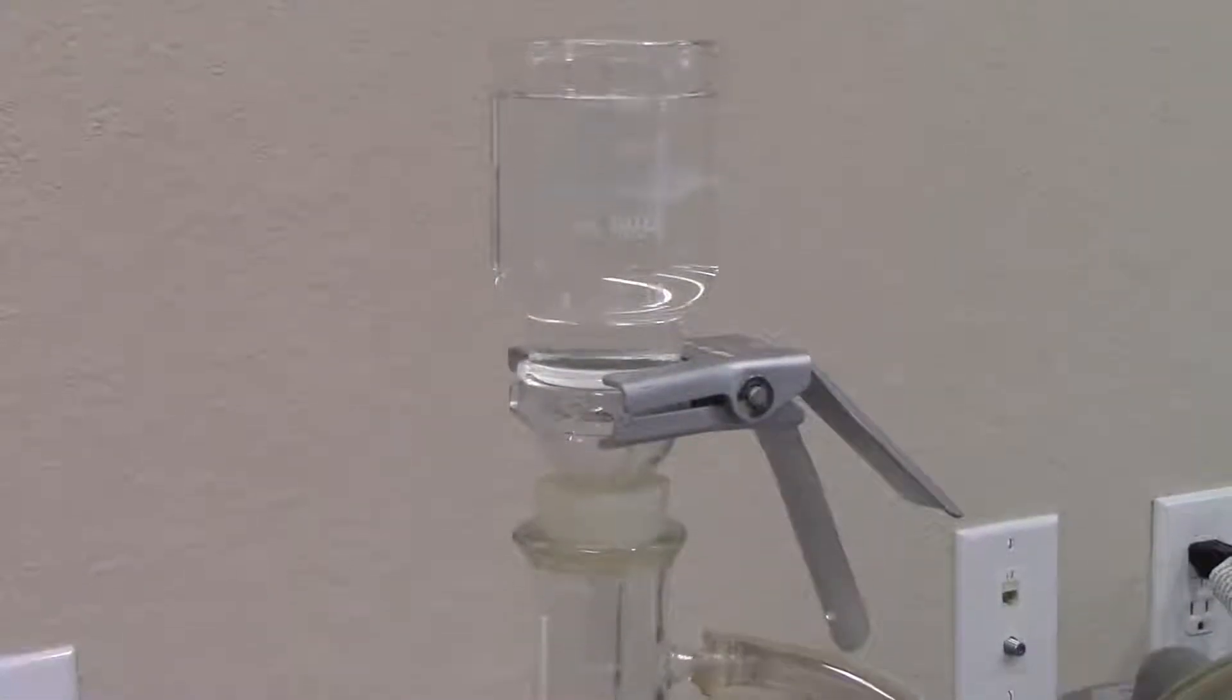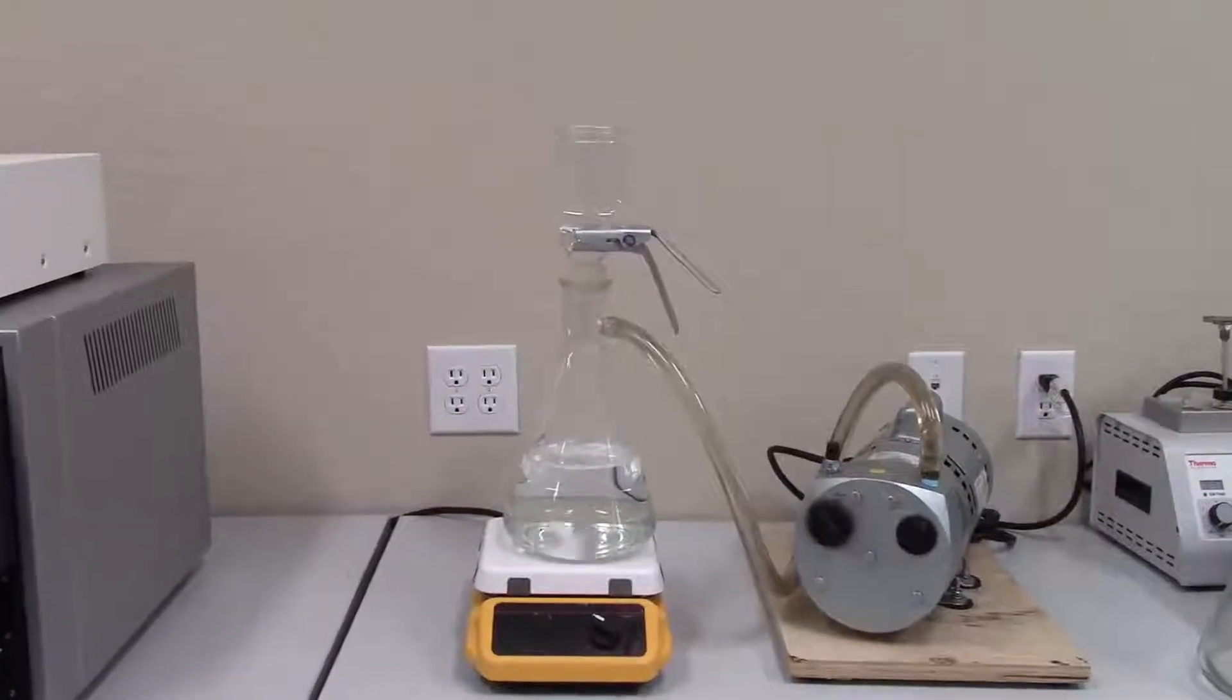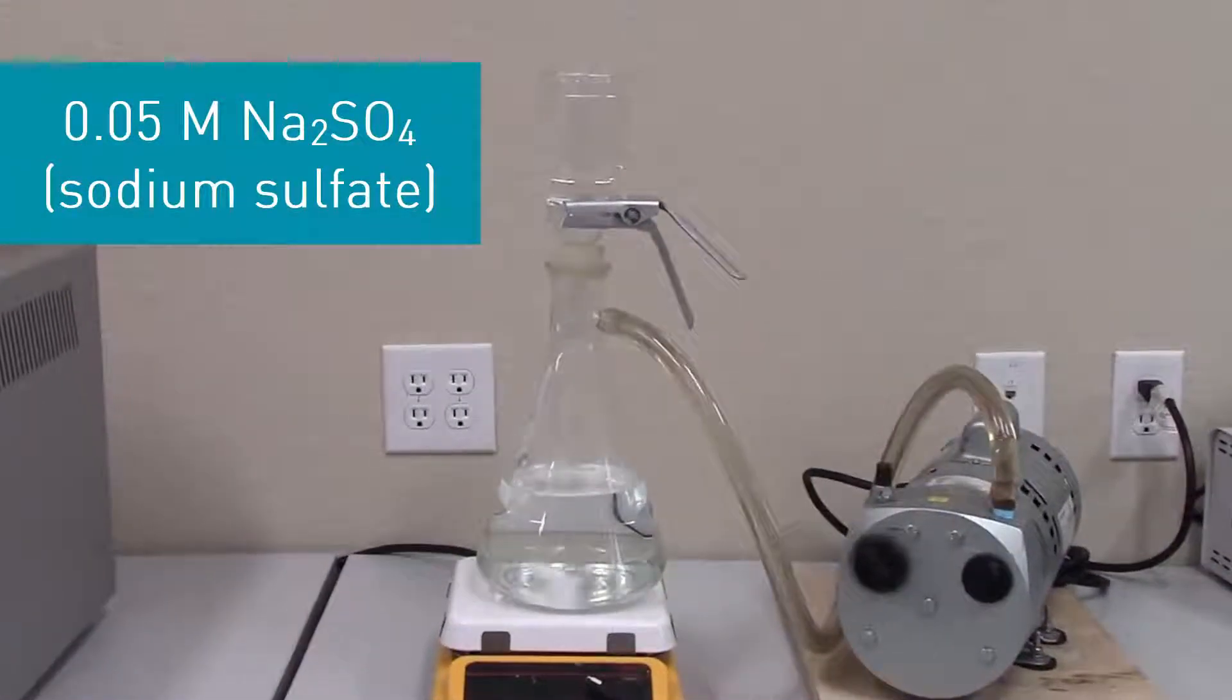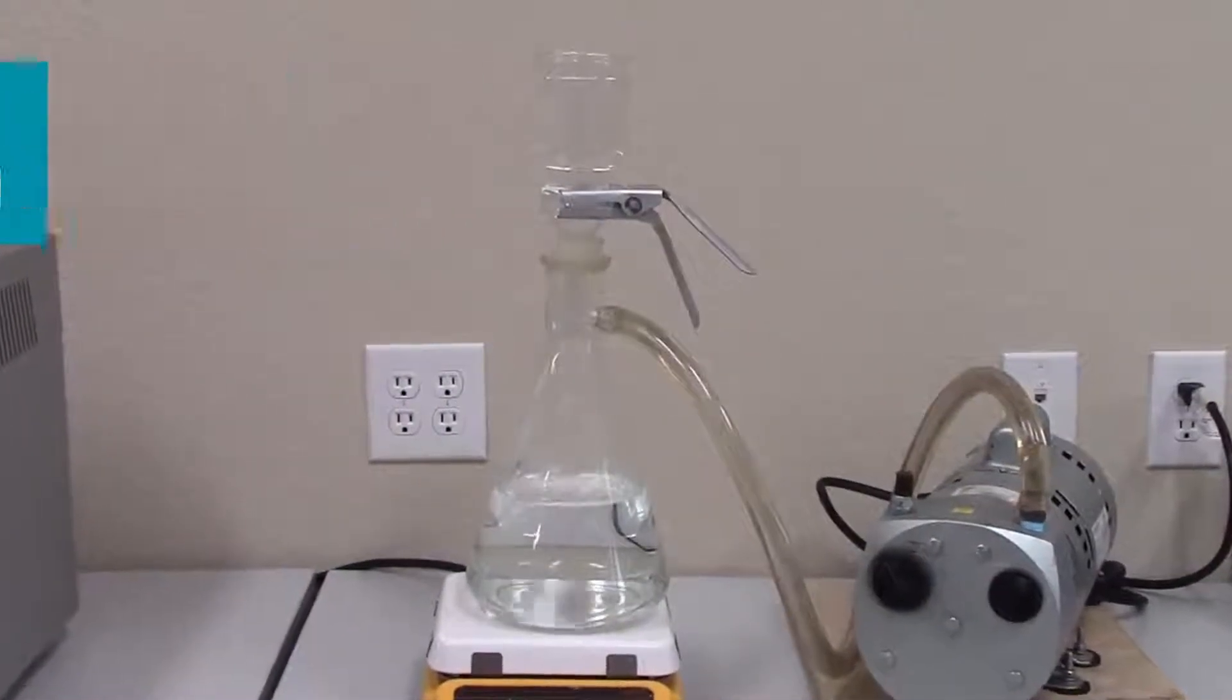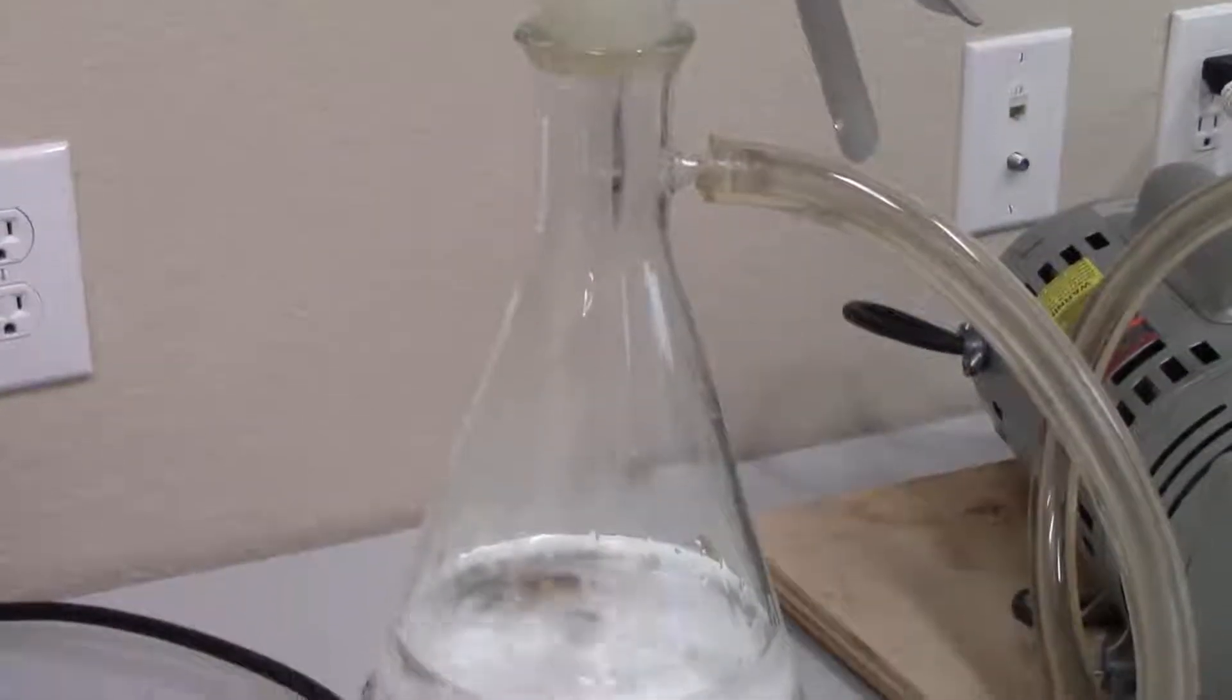This video will demonstrate how to prepare and vacuum filter a mobile phase. As an example, I will prepare a solution of 0.05 molar sodium sulfate, an aqueous mobile phase containing salt, but the procedure presented here is also applicable for organic-based mobile phases.